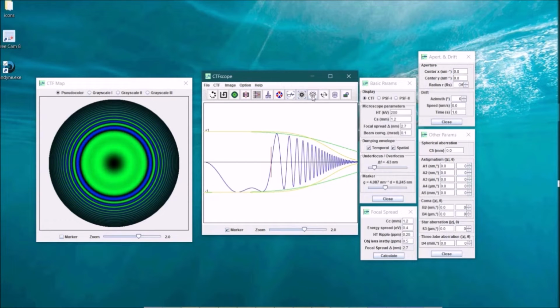And this is for you to load an image, and then you can do two kinds of processing: use a CTF or a CTF absolute value. And here are options for you to change the interface of the whole window. Make a graphic bar in, on or out, or change to a different appearance.